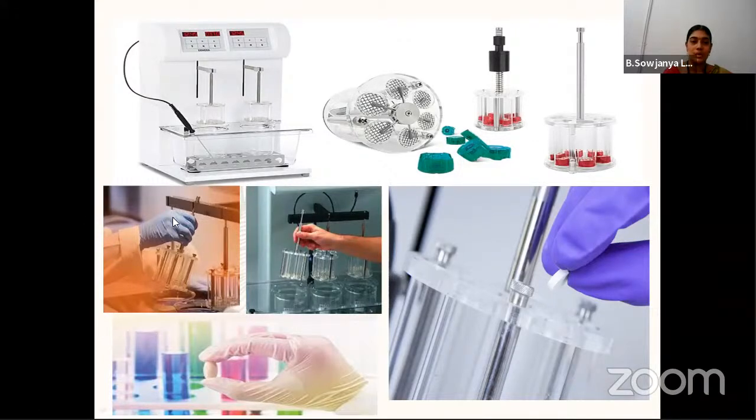Taking the disintegration apparatus, two types are available, basket A and basket B. The mesh observed at the bottom is a 10 mesh screen.